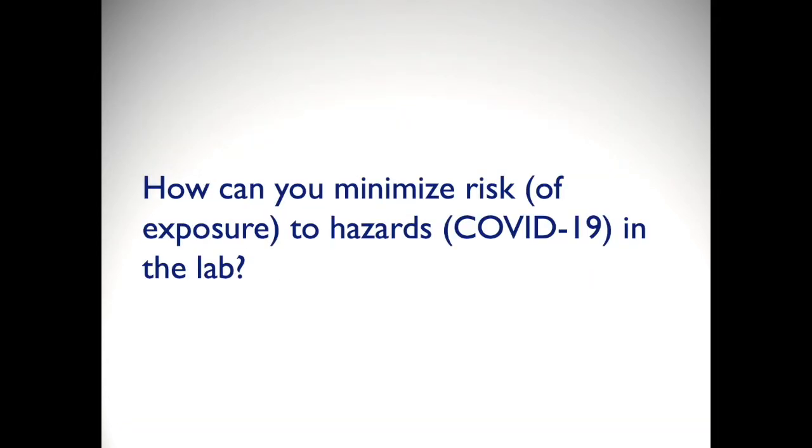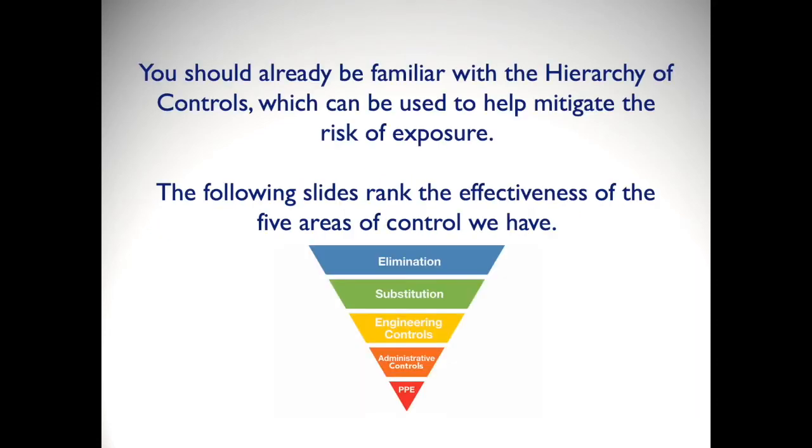How can you minimize risk of exposure to hazards like COVID-19 in the lab? You should already be familiar with the hierarchy of controls, which can be used to help mitigate the risk of exposure. The following slides rank the effectiveness of the 5 areas of control we have.